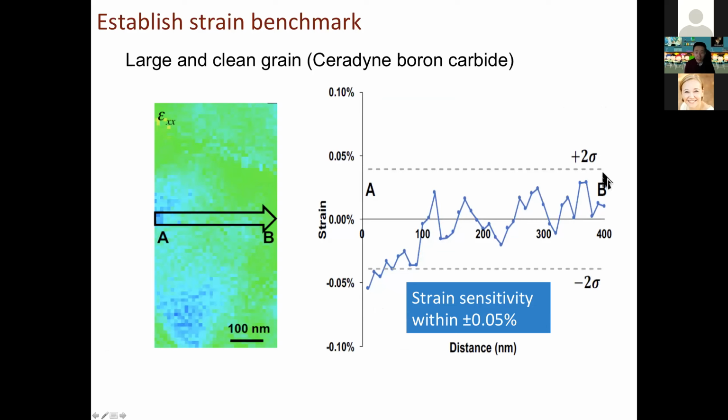It's not too bad. If we look at the standard deviations indicated by the sigma, looking at 2 sigma as the boundary, the strain sensitivity is within 0.05%.